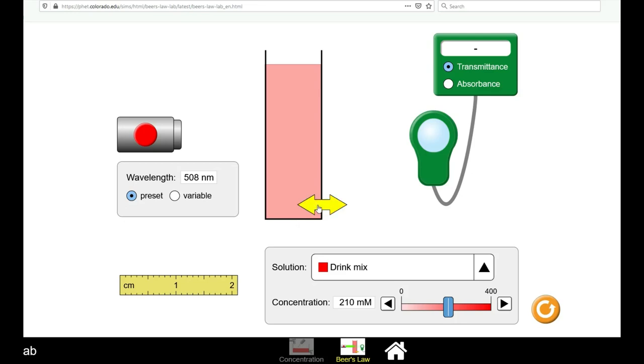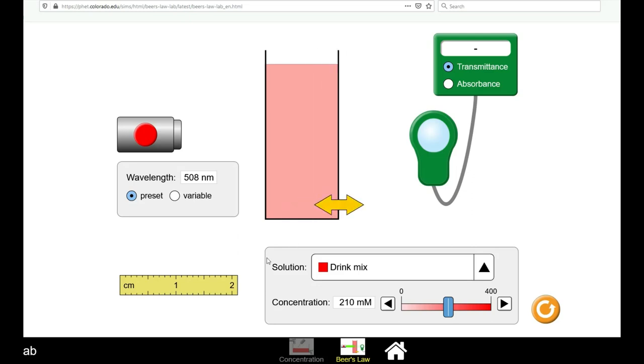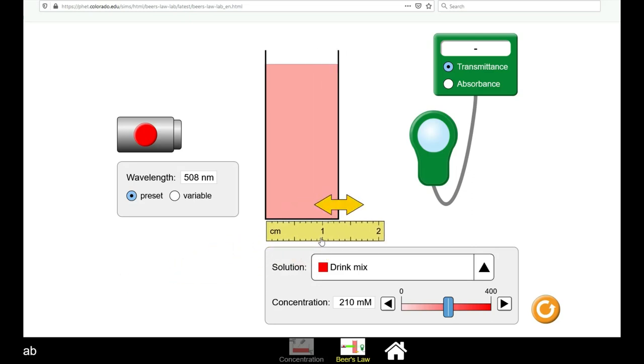You can also vary the size of the container and measure the distance that the light has to travel through. The light source is turned on by the red button on the left.